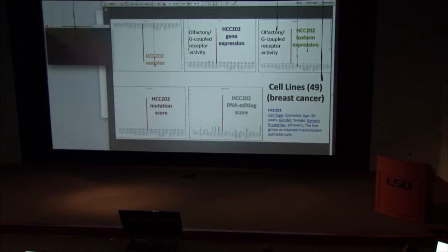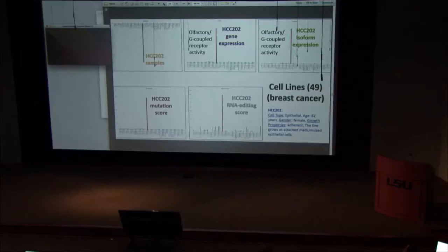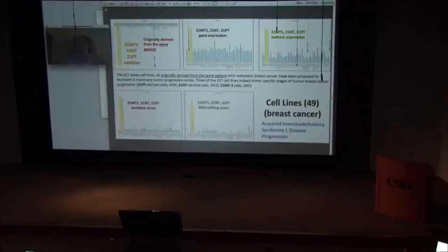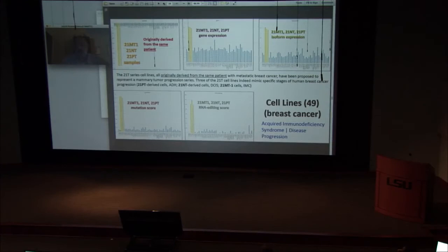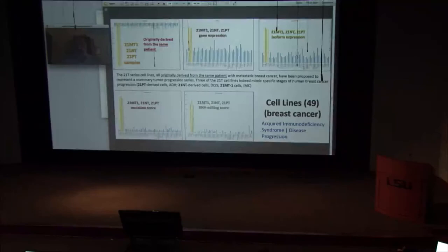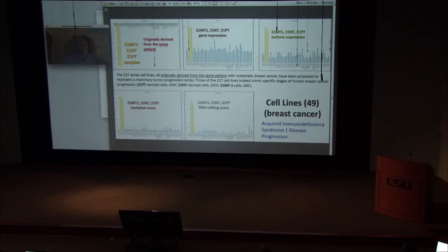By this analysis we get hundreds of subgroups, and typically only one cell line is in the group. But the program also detected specificity of three samples together — three samples together are very separated according to a group of genes, a group of isoforms, a group of mutation regions, and RNA editing. Why three and not one? It appears that all three are originally derived from the same patient. So this specificity of gene expression and isoforms is a memory of this specific patient from which these three cell lines were derived.